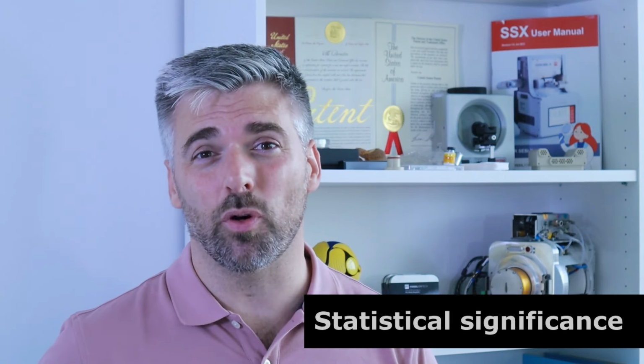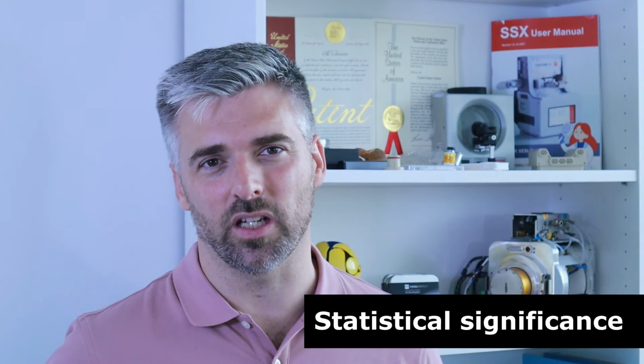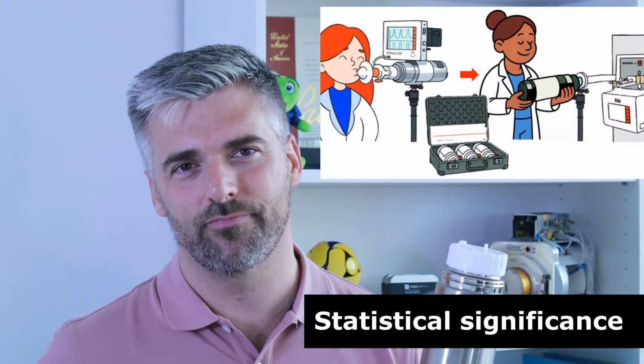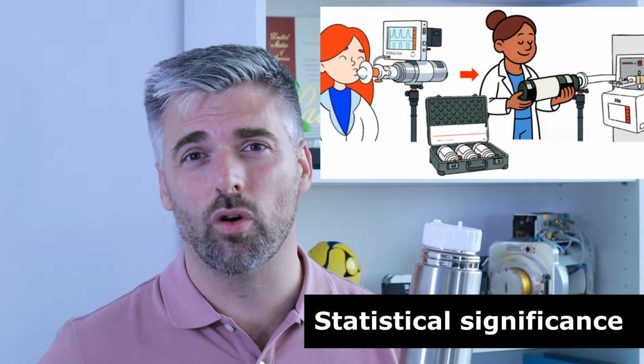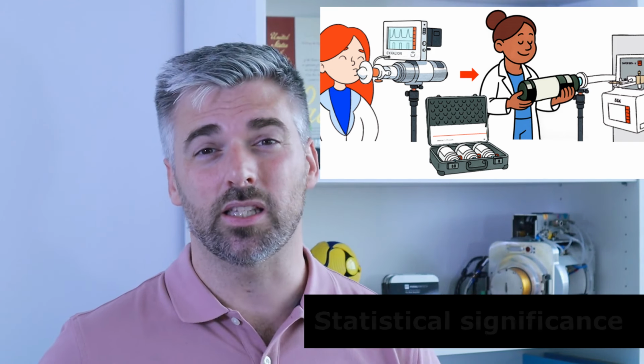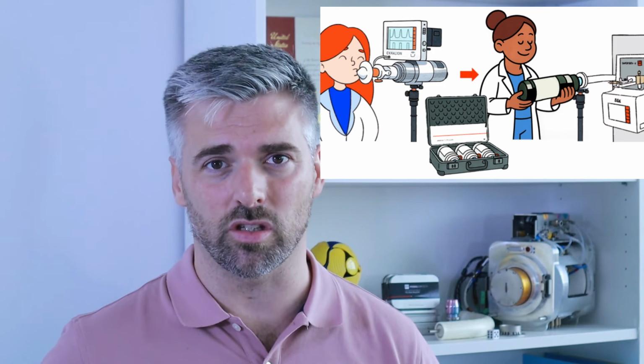Objection number three, they say bringing people into the lab to exhale into the analyzer is not always possible. And they are totally right. And it's an important point impacting the statistical significance. That's why we developed our own offline breath analysis system. This design builds on prior work from other scientists who used bags with SESI. It's designed to minimize condensation losses.